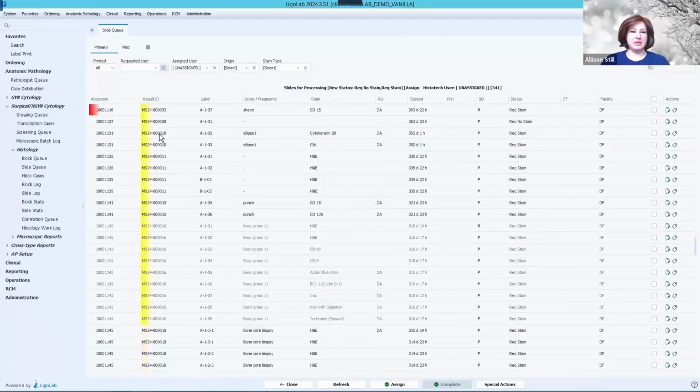And then similarly in the result ID column here, a color is a turnaround time indicator. So again, you can configure for your laboratory on a test by test basis how you would like this turnaround time coloring to go into effect. You will configure as many buckets as you would like for time periods in which different colors should apply.